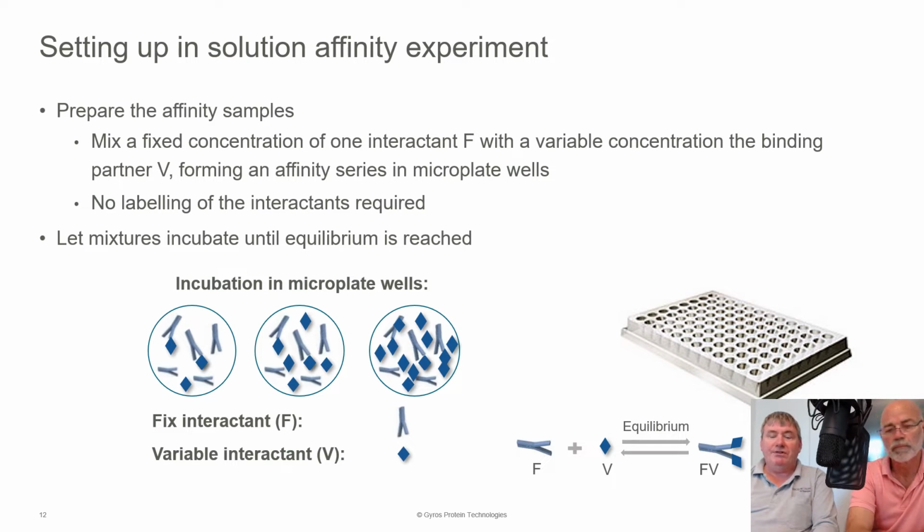What you're effectively doing is trying to measure the free amount of fixed analyte. We will go through it using our test assay. We're going to go through the IgE and specifically show you how this is practically done, giving you actual examples showing how the curve and how we've decided on the concentrations to use.